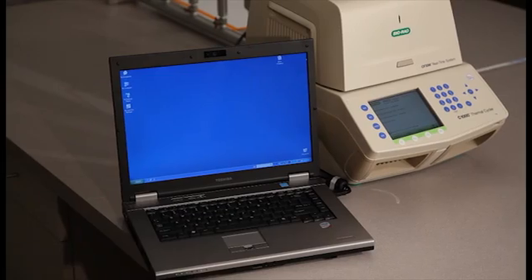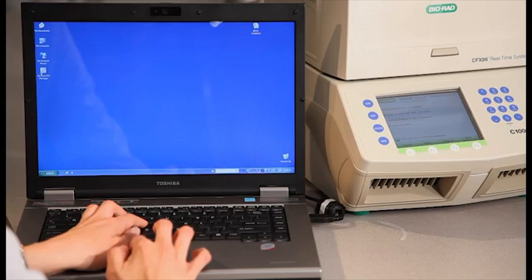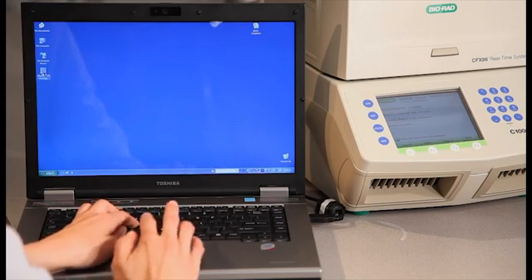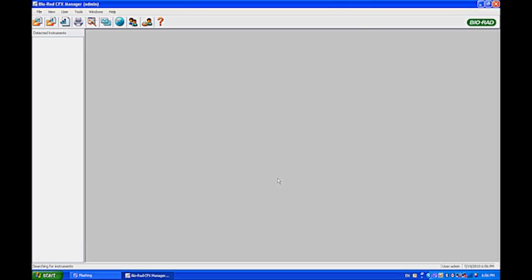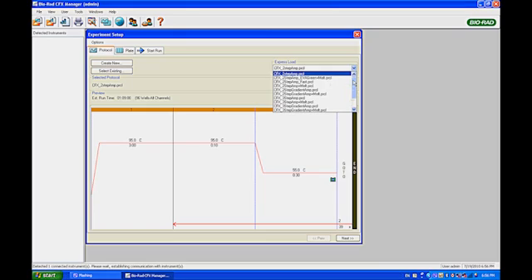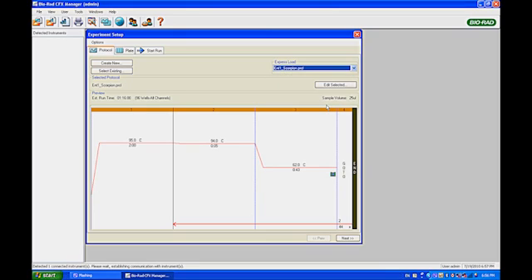Open the CFX Manager software on the attached laptop computer and select Create New Experiment. Under Express Load, select Rapid Scorpion.